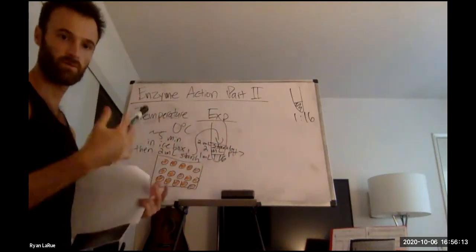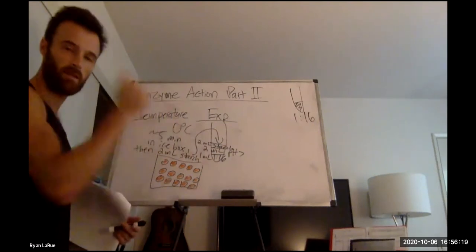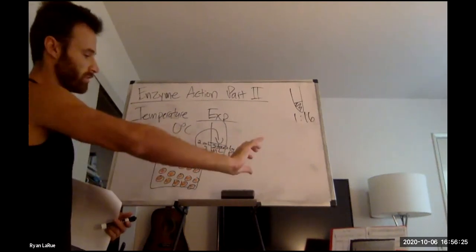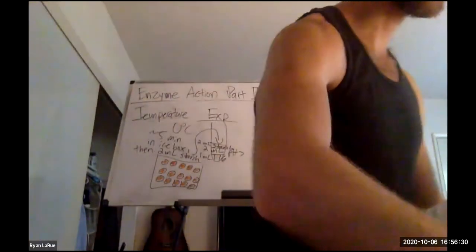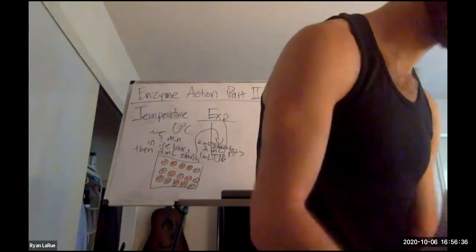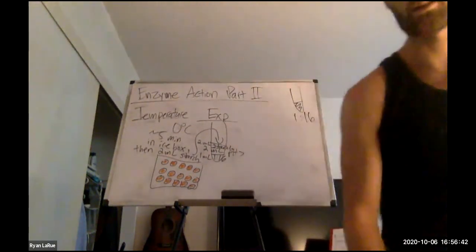And then, of course, right as you do that, the reaction occurs. You wait the 30 seconds, just like before. Pipette, 30 seconds, pipette, etc. And then you would do this after you'd finish that row for room temperature, which is 20 degrees Celsius, 37 degrees Celsius, 53, and 80.